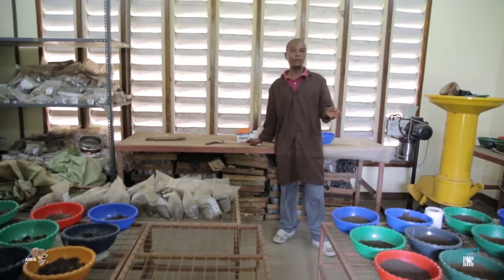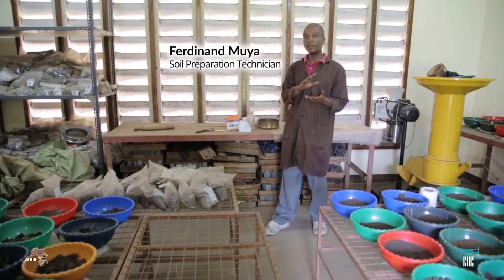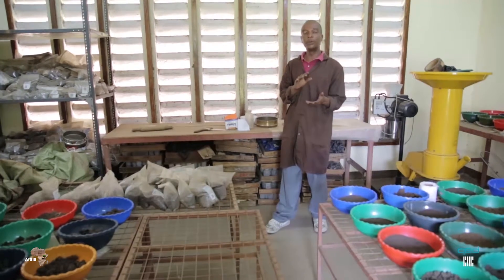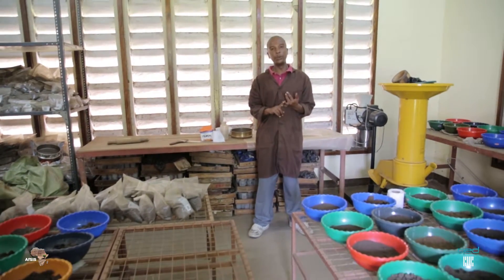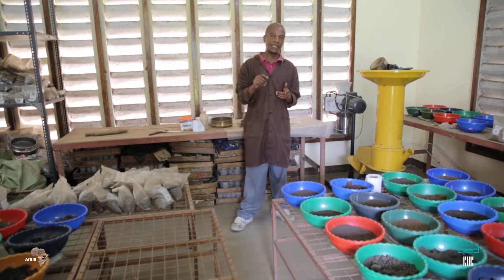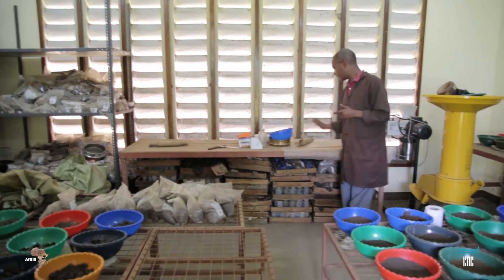First of all, we have to dry the soil until we make sure that it dries in a proper way, which is required by the soil processing procedure. The second thing we have to do is to weigh the soil if it's already been dried. Third, after weighing the soil, you put it in a high polythene bag like this one.